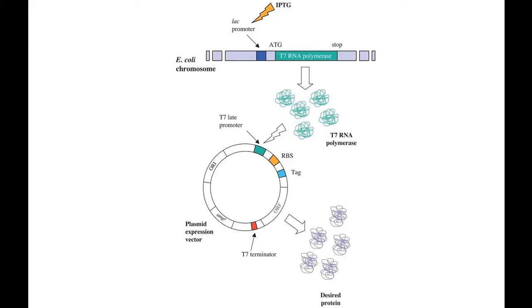Hello! In this video we will talk about the expression and purification of a protein of interest by using a bacterial expression system. This process can take several days. In our case, we completed the bacterial growth, expression and purification in 3 days. Prior to the experiment, we need a bacterial plate, LB medium, IPTG and Ni-NTA column.